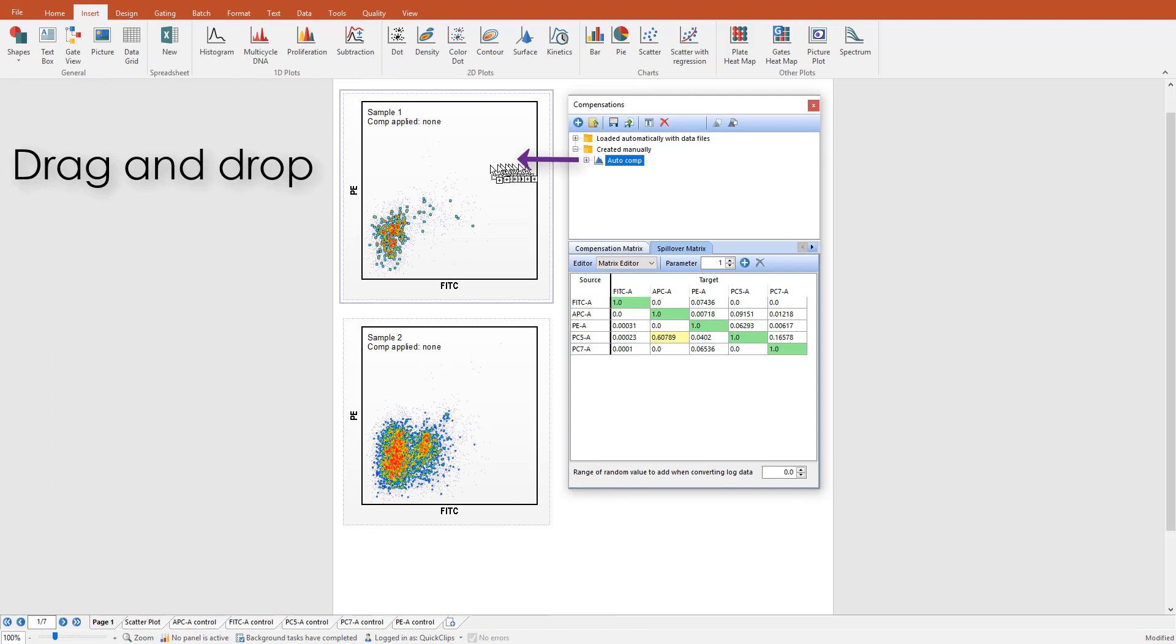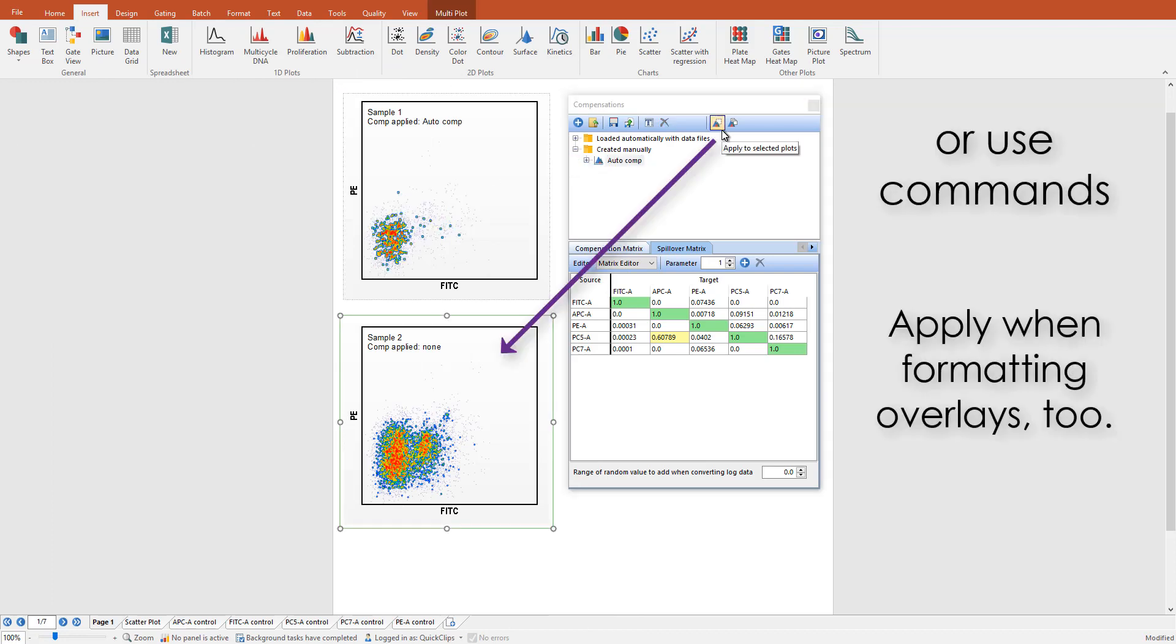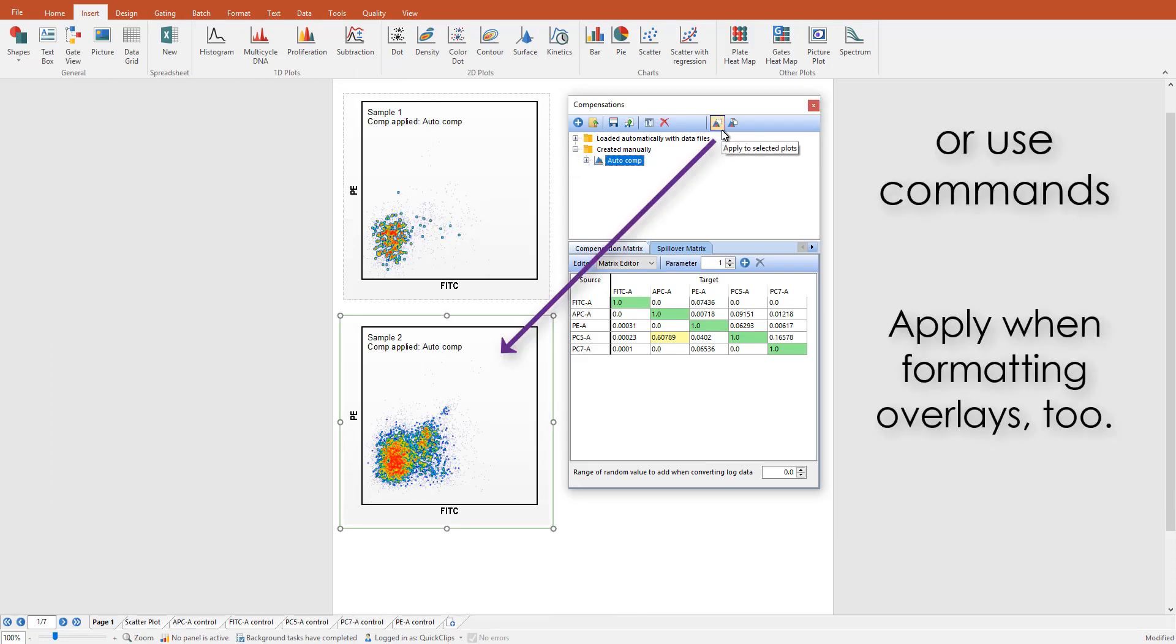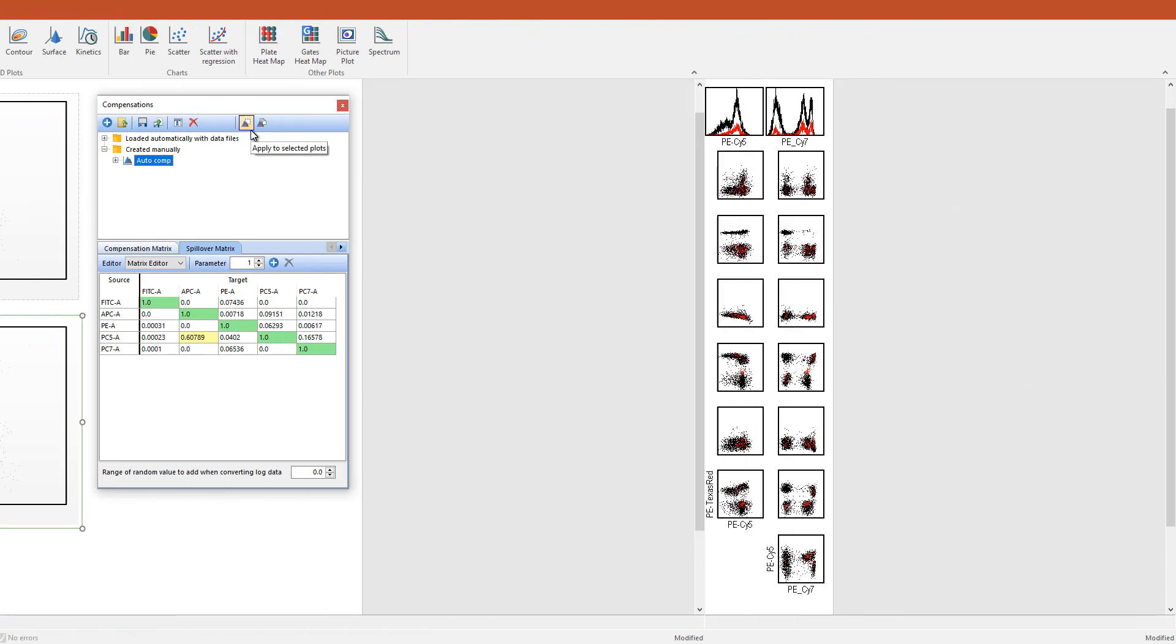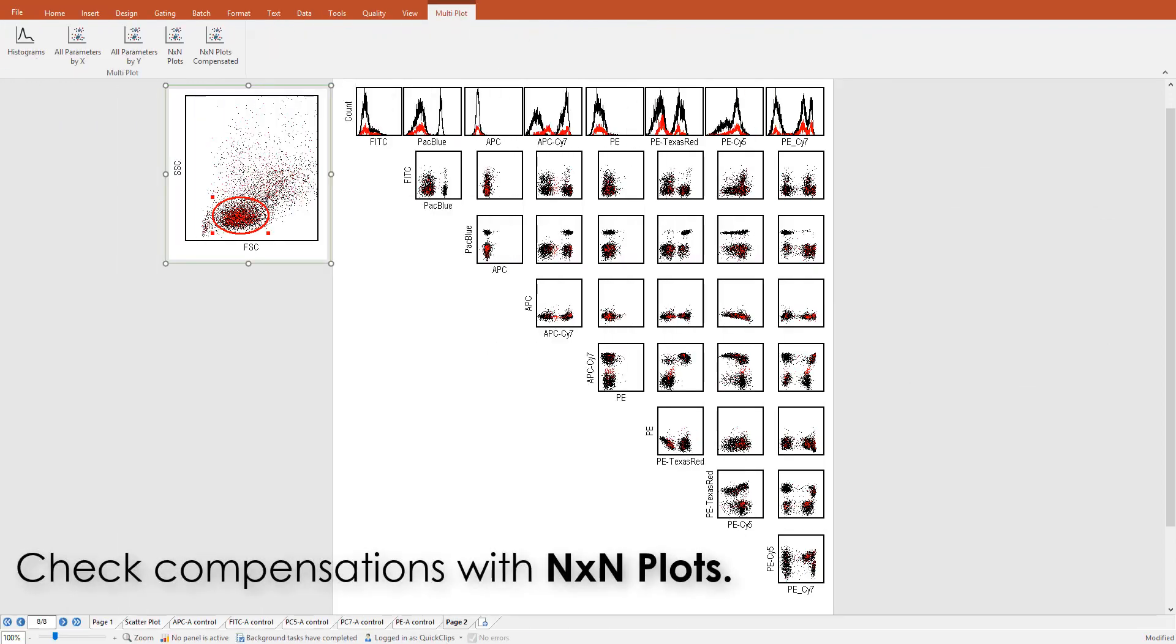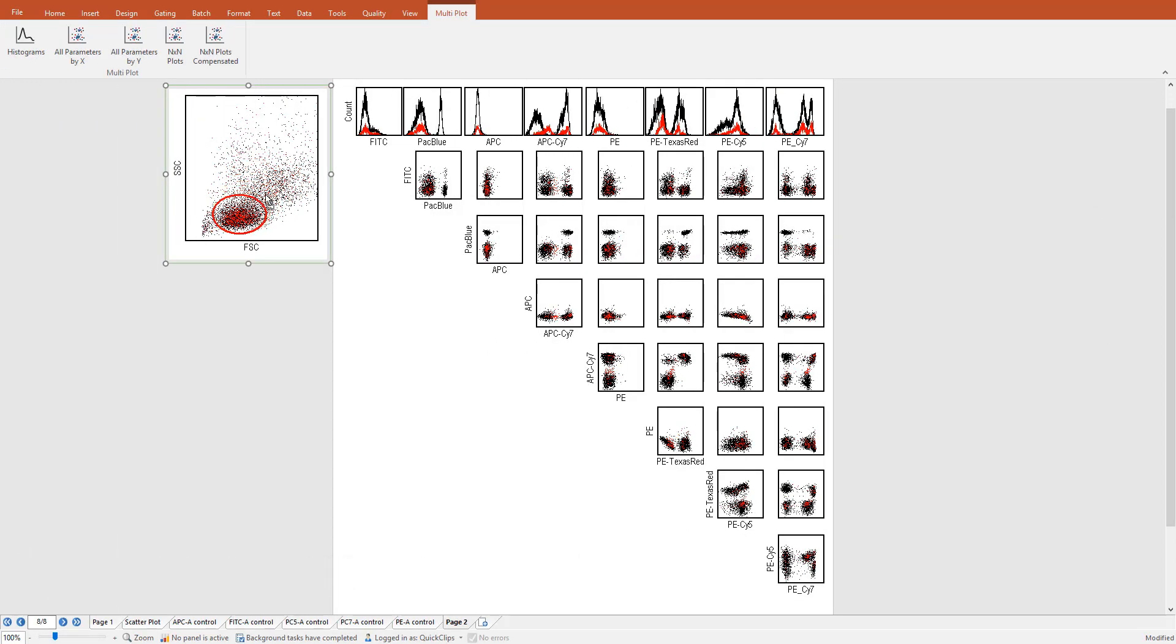Apply compensations by dragging and dropping or choosing the commands in the Compensations navigator. Review your compensations within biaxial plots.